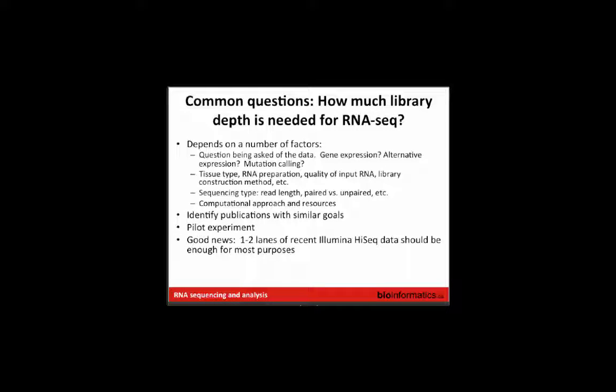Okay, so how much depth? I guess just to disappoint you right away, it's hard, you can't really say, because there are way too many factors that come into how much depth you might need. One of the big ones is what you're going to ask of the data. So what kind of analysis do you intend to do?